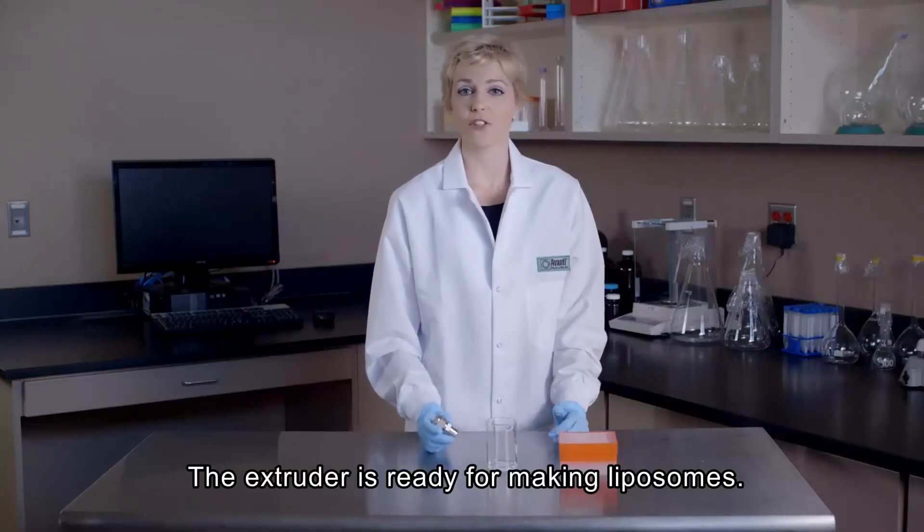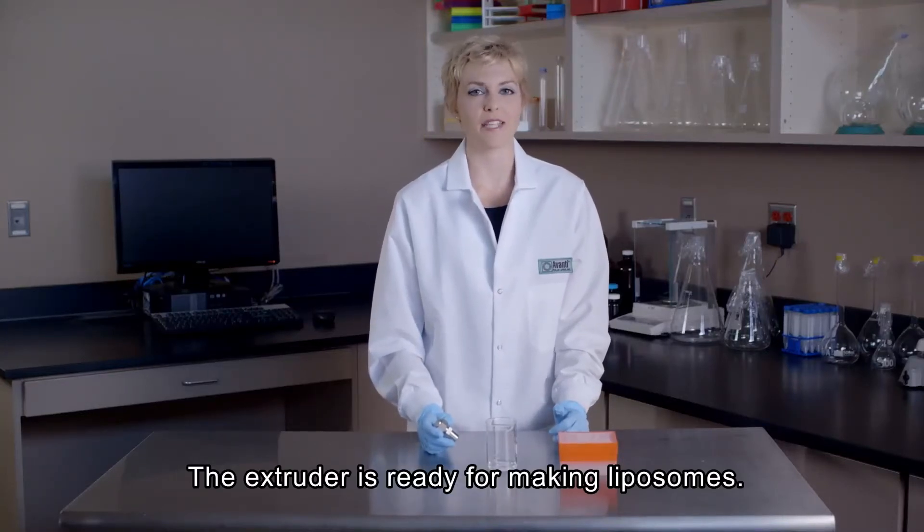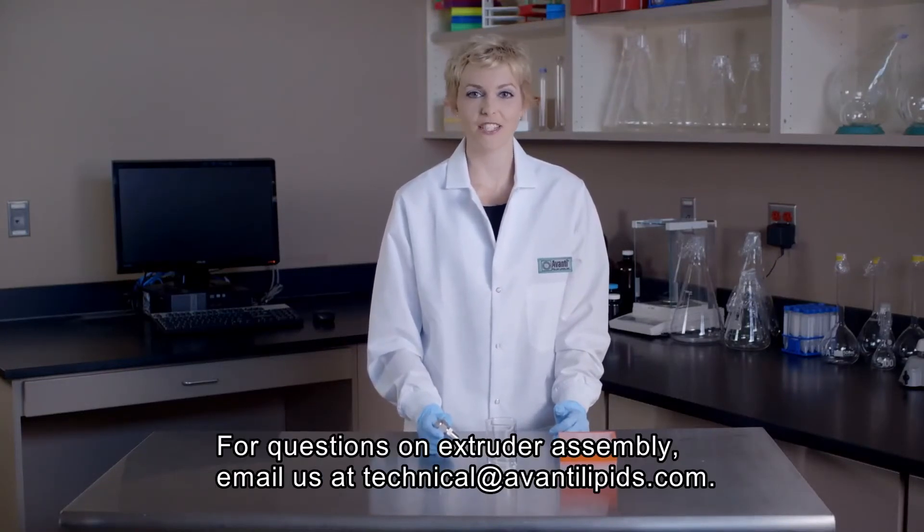Now the extruder is fully assembled and you're ready to make liposomes. For any additional questions on extruder assembly, email us at technical@AvantiLipids.com.